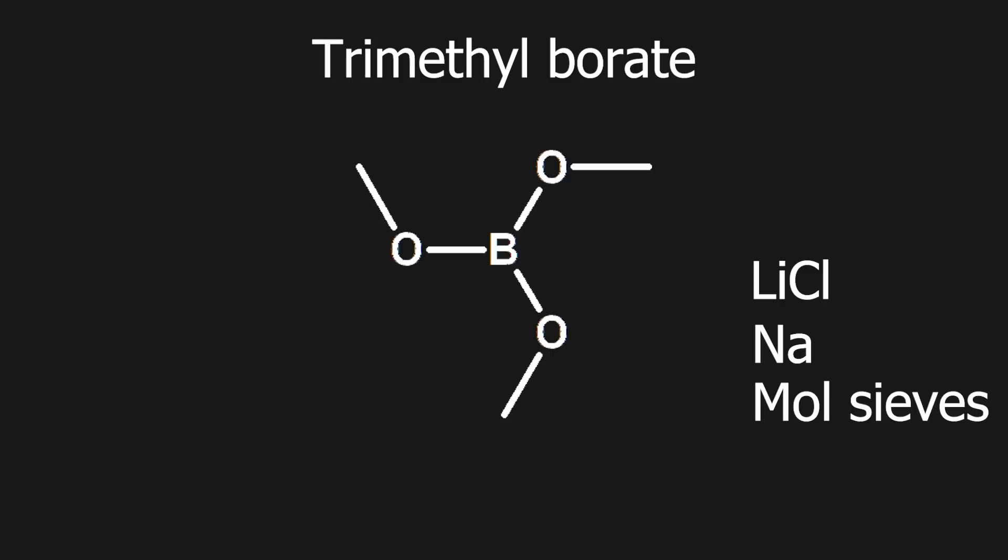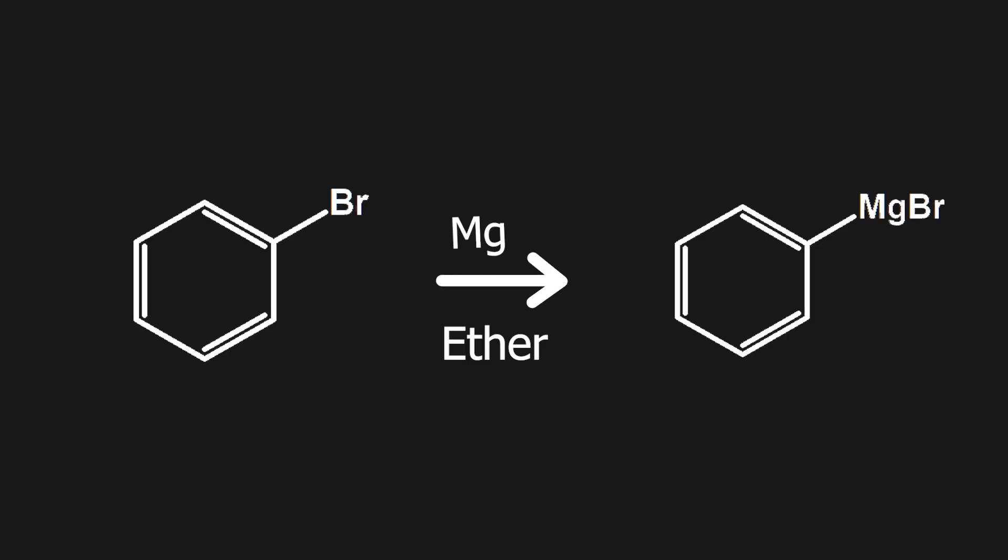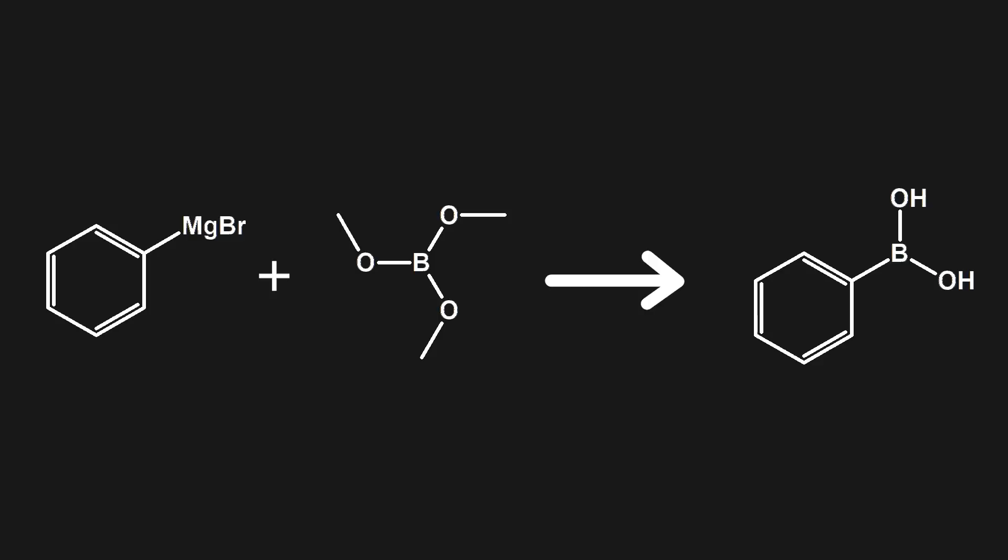Anyhow, I had to buy some instead. And with that, I can continue with the next step, which is making phenylboronic acid. First, I will prepare a Grignard reagent by reacting bromobenzene with magnesium metal to form phenylmagnesium bromide. I can then use this Grignard reagent and react it with trimethylborate to form phenylboronic acid.